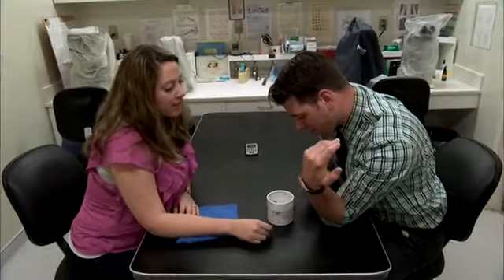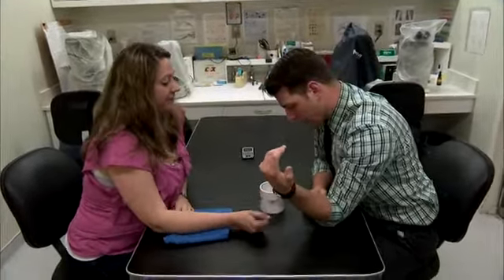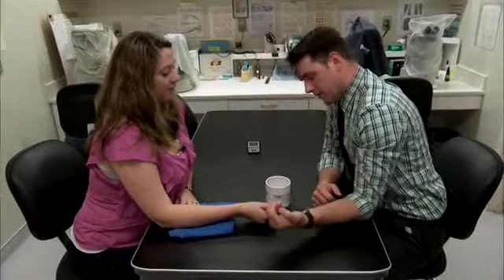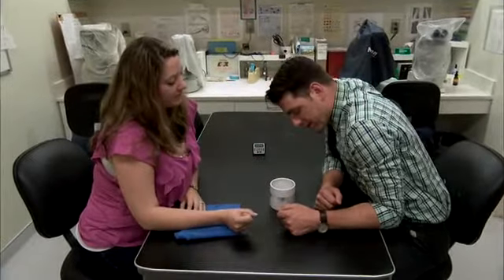Yep. And I'm starting to see them light up. I've got some of my blood in there. Yes. You can see, right? Okay, so do you see the ones that have fed? Yeah, they're moving a lot slower now. They're moving slower, so they're super full. And you can see they've got big, fat, bright red bellies. Filled with me. Filled with your blood. My blood. Yes. Okay, so they're fed.